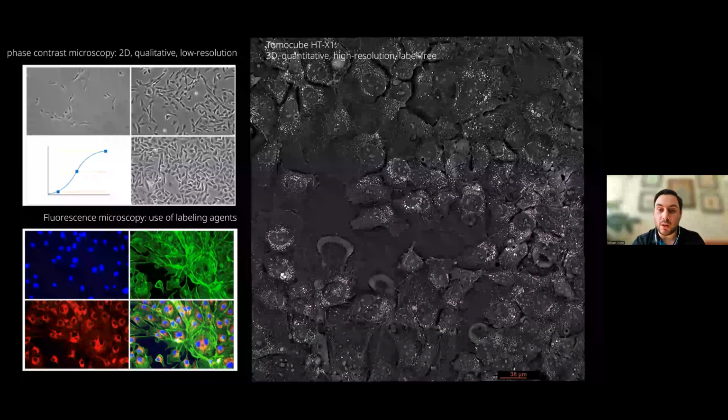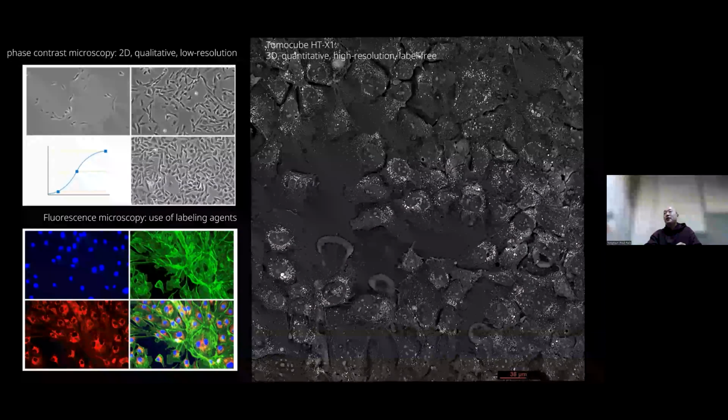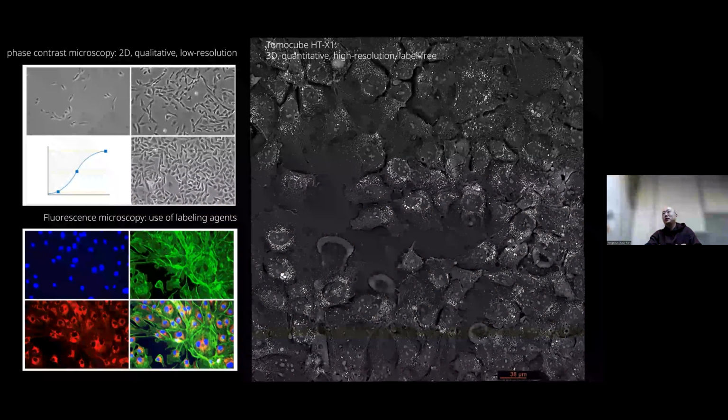Can we acquire high quality images of C. elegans tissue and cell morphology in vivo? Quick answer is yes. We can see even bigger samples. I think DJ will show you some of the demonstration movies. Sure.